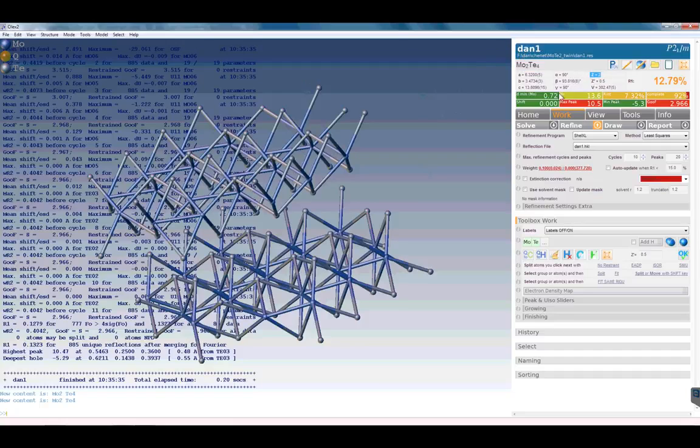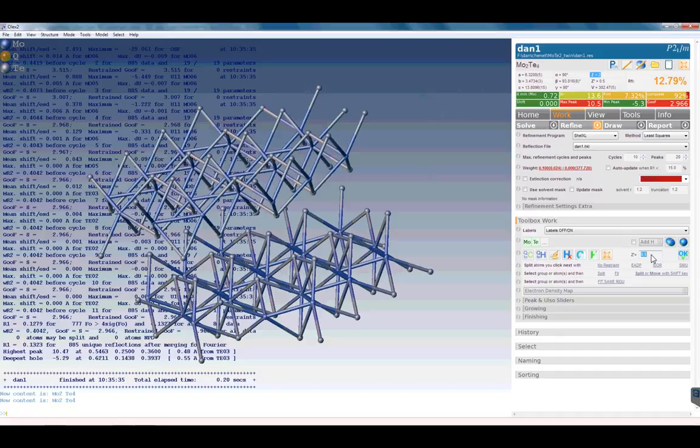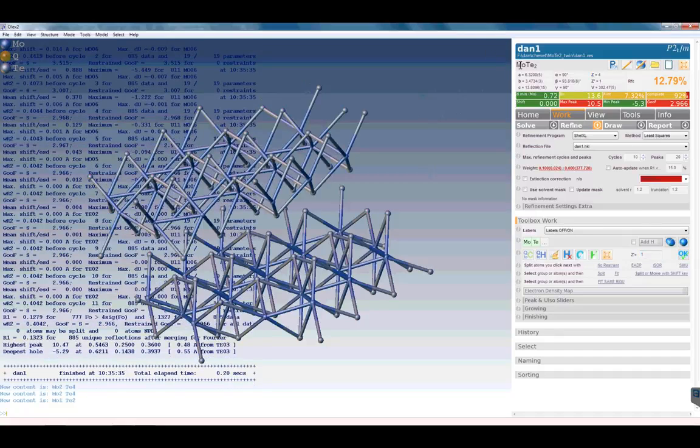As long as you notice both of those numbers, then whatever you put in the Z prime box, it's not important right at this point. So we have MO2TE4 with Z of 2. I'll fix Z prime, I'll set it on 1 so that this formula makes more sense. It's MOTE2 with a Z of 4.